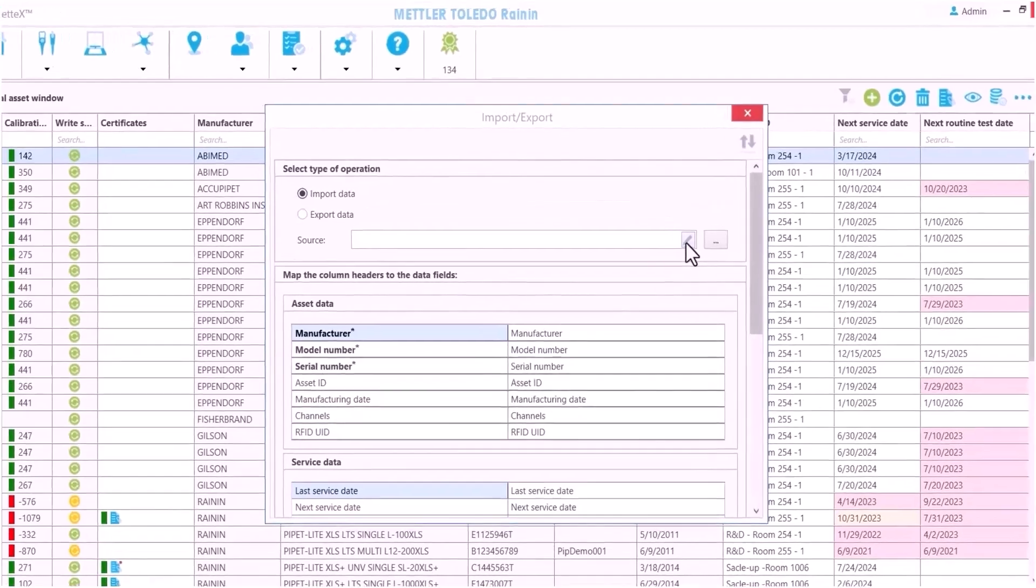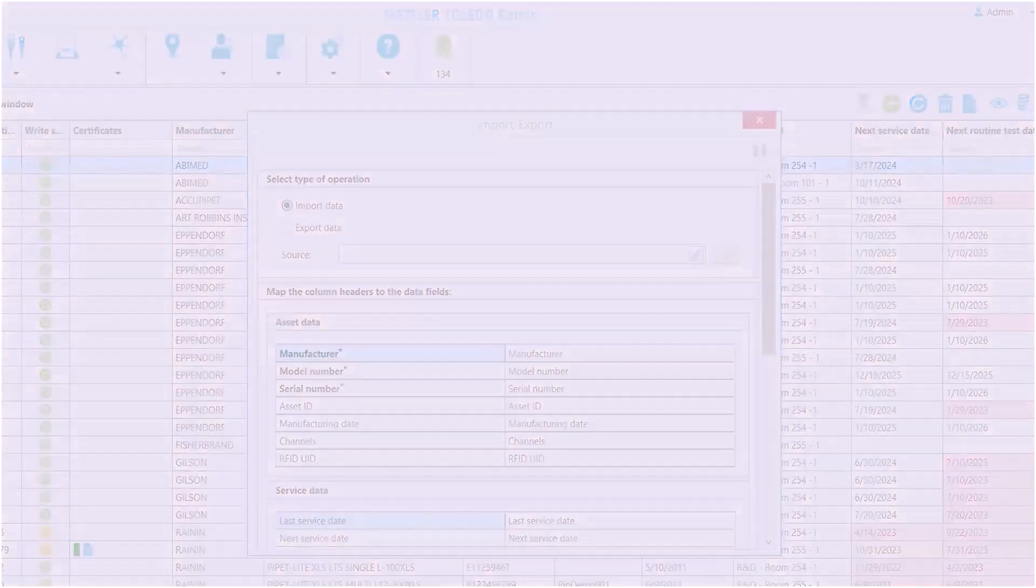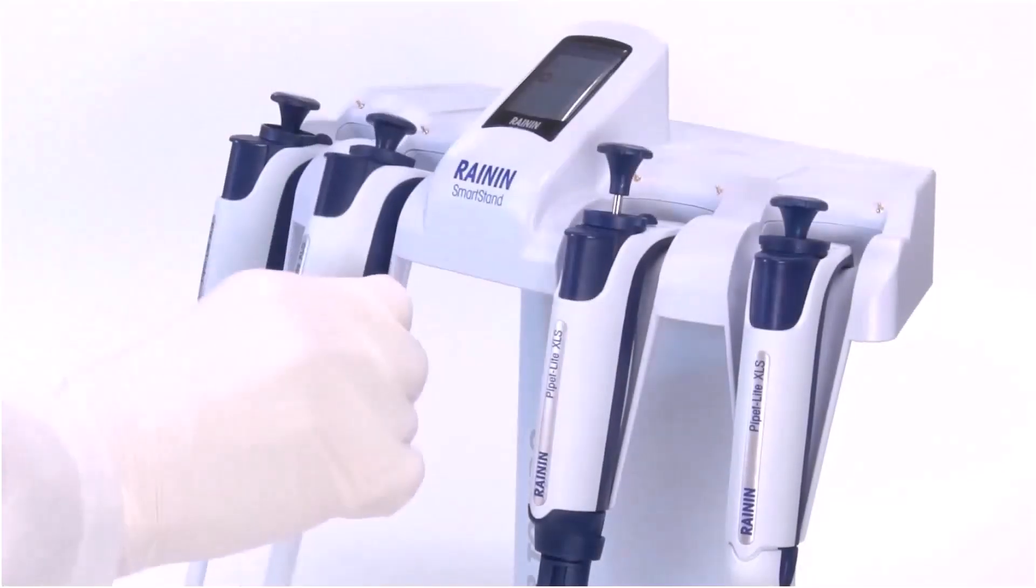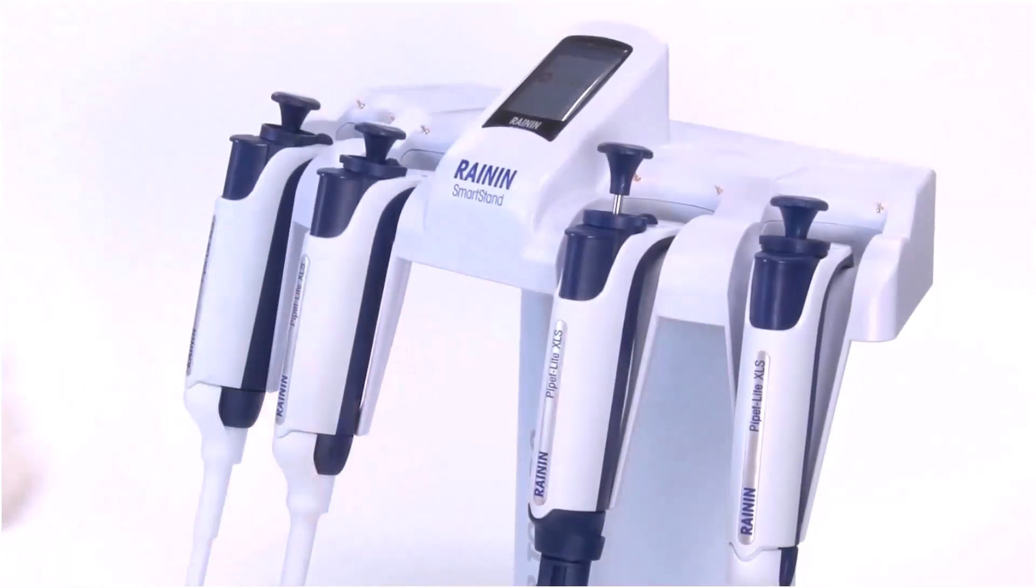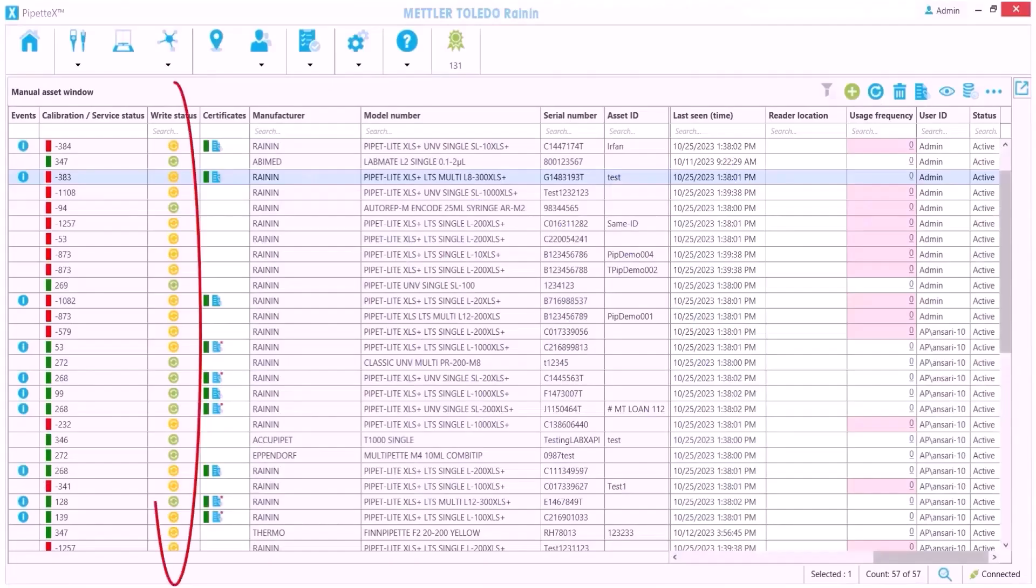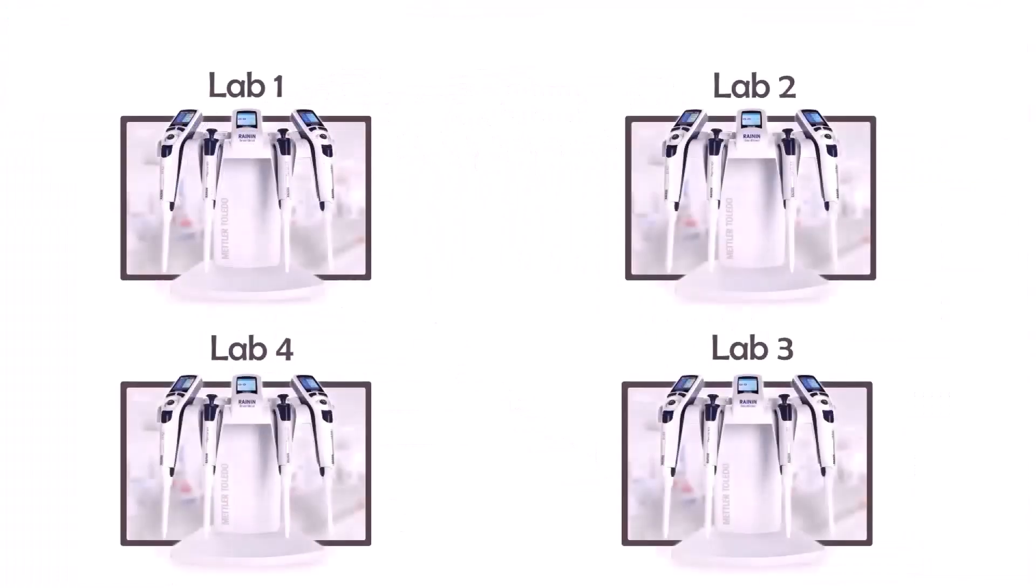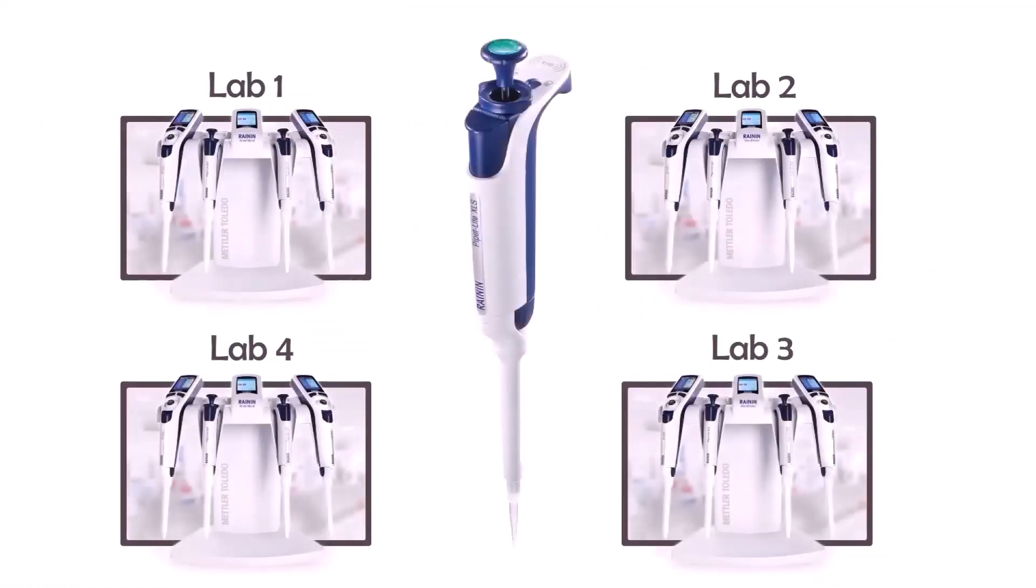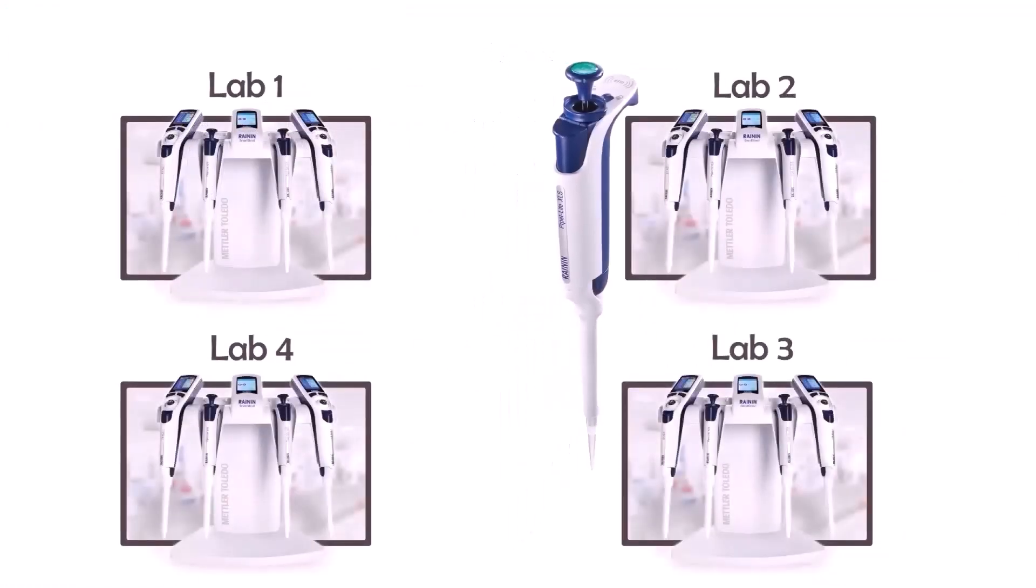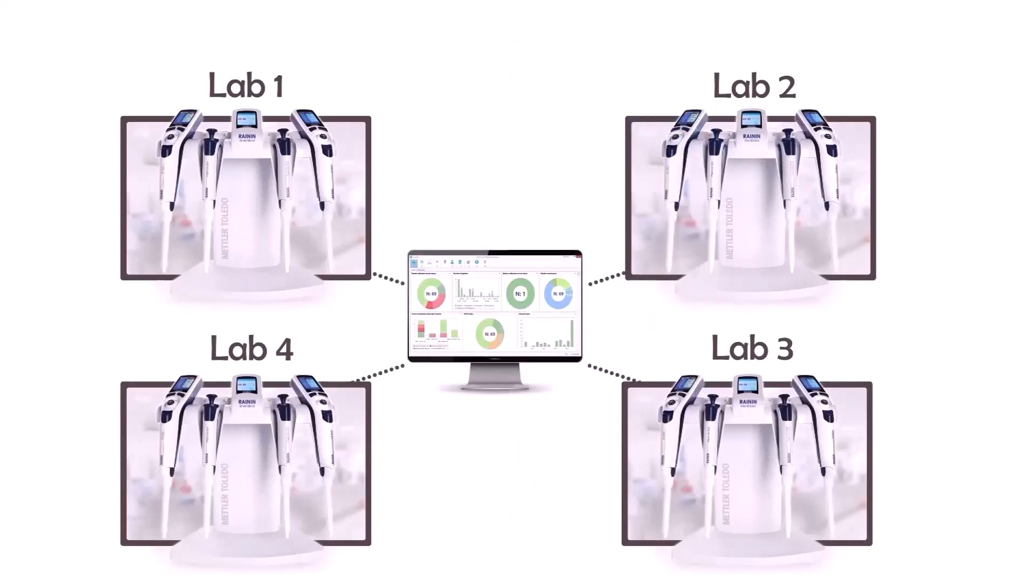I started by just importing the Excel spreadsheet we were already using, and whenever a pipette goes on a smart stand, Pipette X auto-populates and auto-updates the data. We set up a smart stand in each of our four labs and we updated our SOP so any new pipettes are required to be put on a smart stand that automatically registers them in Pipette X.